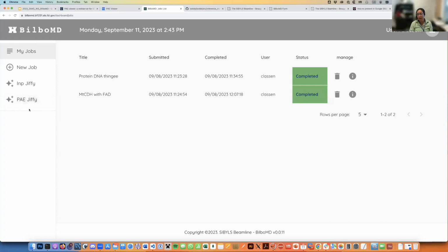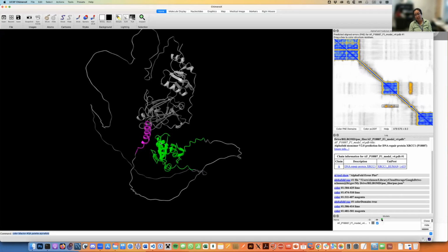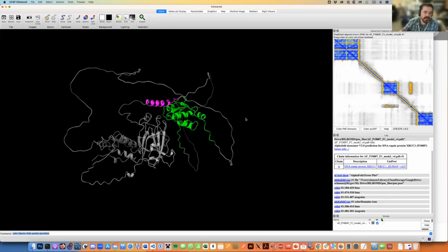Because we had a situation where model 4 suggested something similar to the helix binding to your domain, and then we tested it and it looks like that is indeed the case, but we wouldn't have realized it without model 4. I see.